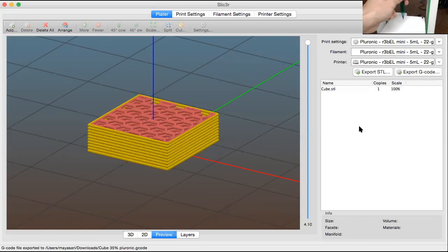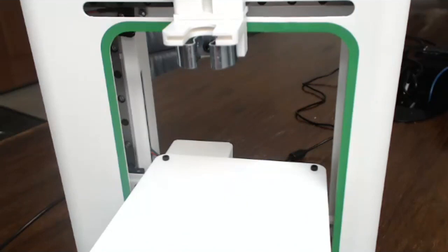So let me stop this. We're going to go back to the printer, and as I mentioned, in this print it's harder to see, but when you have something that is slightly lower viscosity, it tends to be a little bit runnier than the previous material that we were using. I guess Oliver will show maybe 2 prints with a wrong setting and the correct settings.